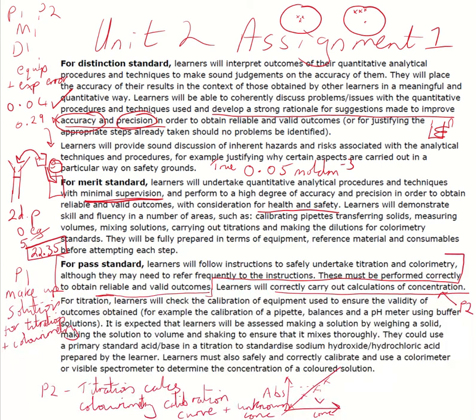The other final bit here, sound discussion of the inherent hazards and risks associated with the titration procedures and the chemicals. So I mentioned one before. When you're filling up the burette, you should be at eye level with the top of the burette so that you are not pouring chemicals over your head.